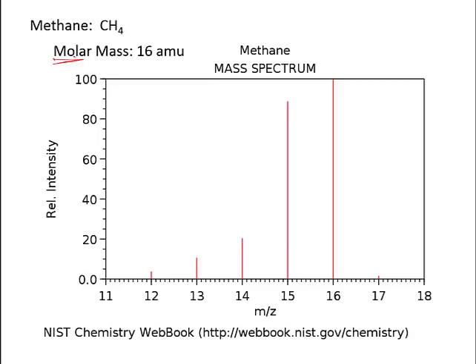When you look at the spectrum, notice that there is a ginormous peak at 16 on the mass scale. Well, that's given the symbol M+. And all M+ means is that's the molecular ion. The molecular ion is simply the entire molecule that has lost an electron. As you might guess, as you knock an electron out of a molecule, it becomes unstable, much like myself. Whereas I've begun to lose hair follicles, I think this molecule is going to begin to lose hydrogen atoms.